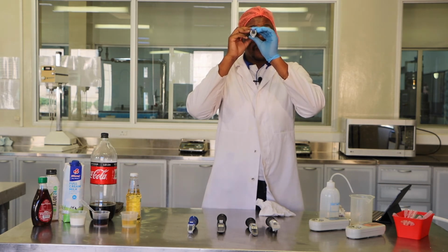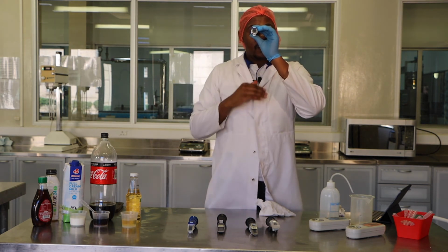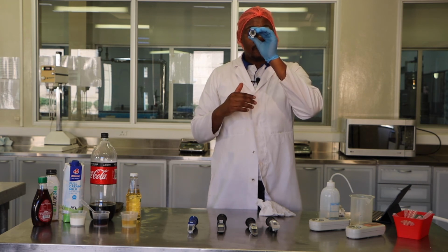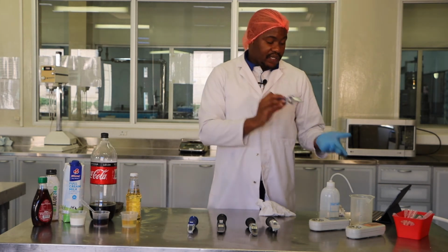And then again, if I use this refractometer, it shows that the line is below 0. So basically there is no sugar present in this type of beverage. So you can then discard the sample.